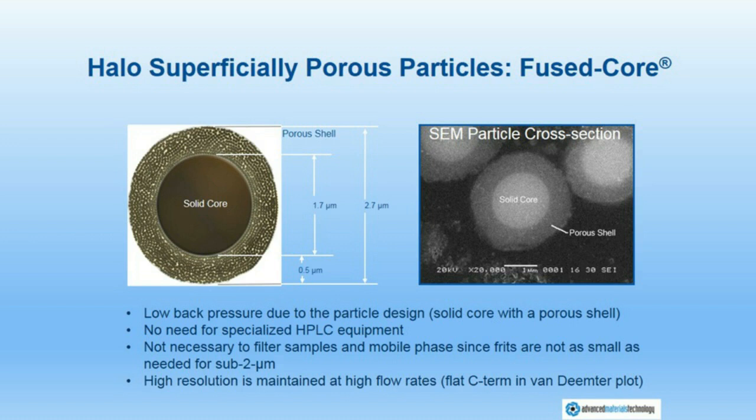But the driving purpose for a superficially porous particle morphology is to maintain high resolution at higher linear velocities. That is, to reduce analysis time while still allowing high efficiency.